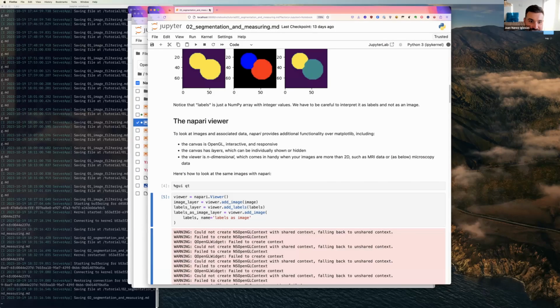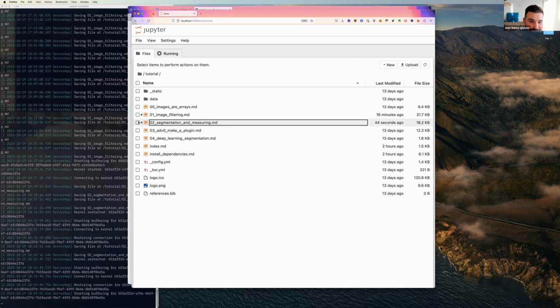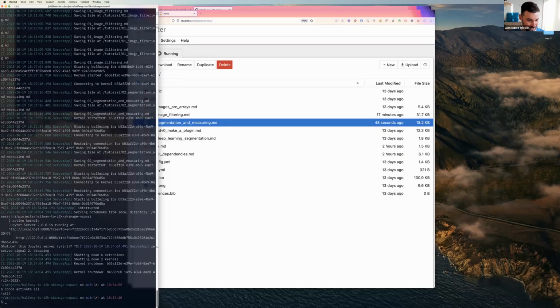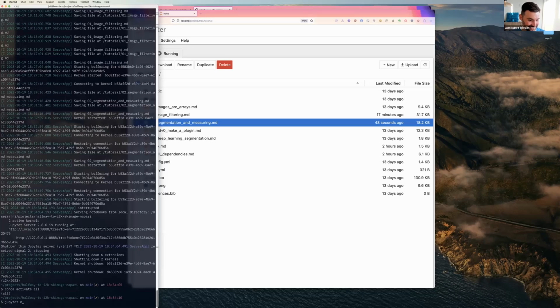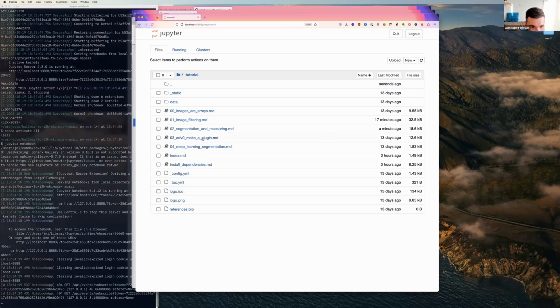I'm just going to fall back to my non-tutorial environment because I know that works and some things will be different, but we're just going to have to live with that. Okay. This always happens when you're teaching. All right. So this is the classic notebook. That's okay, I think.